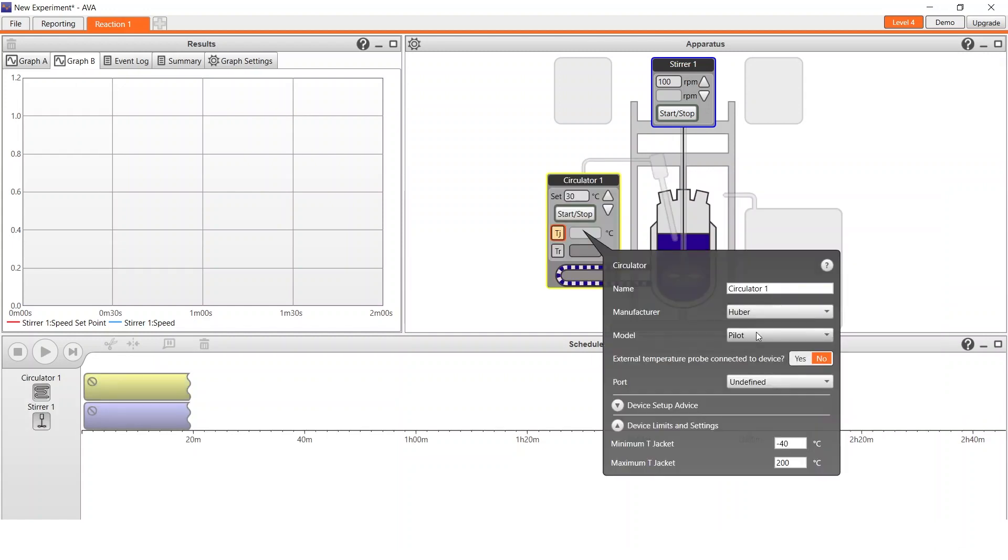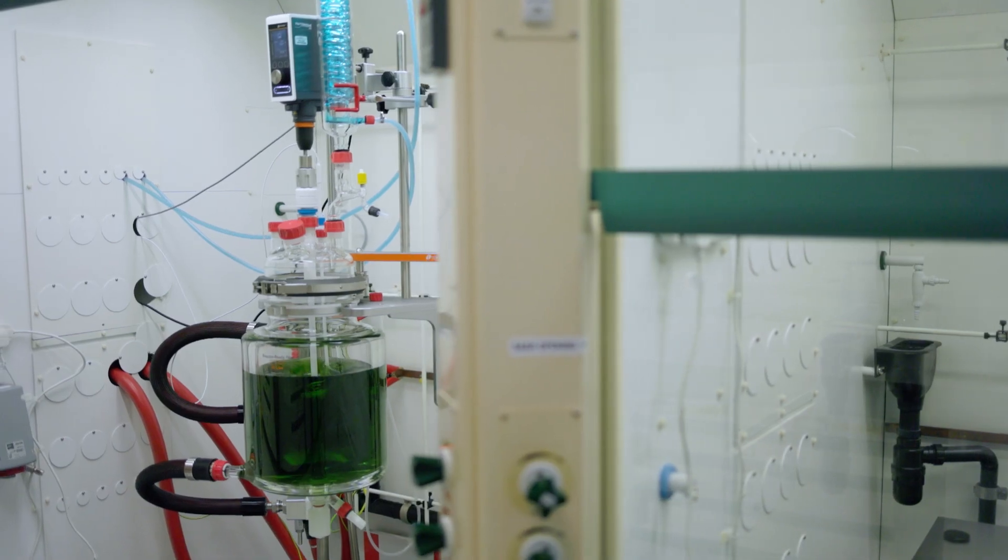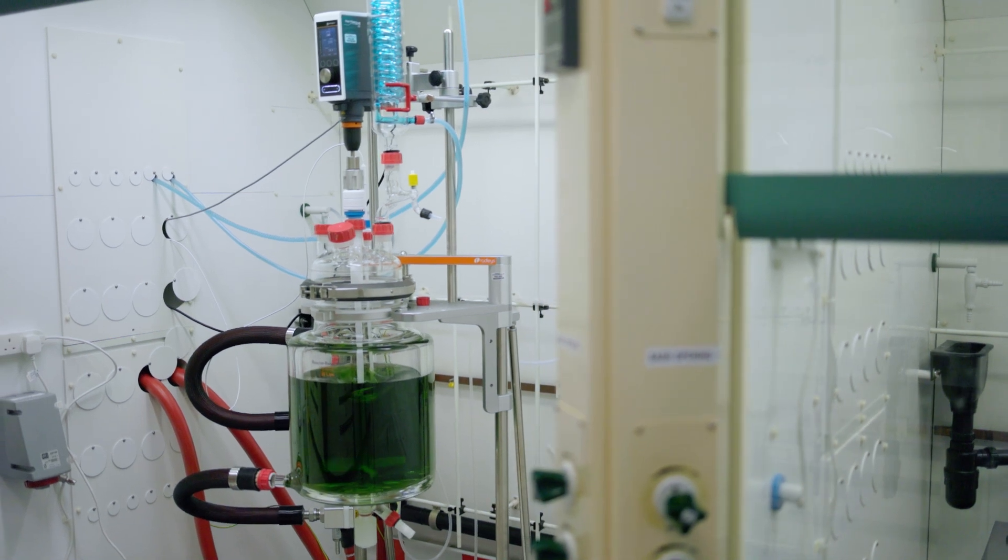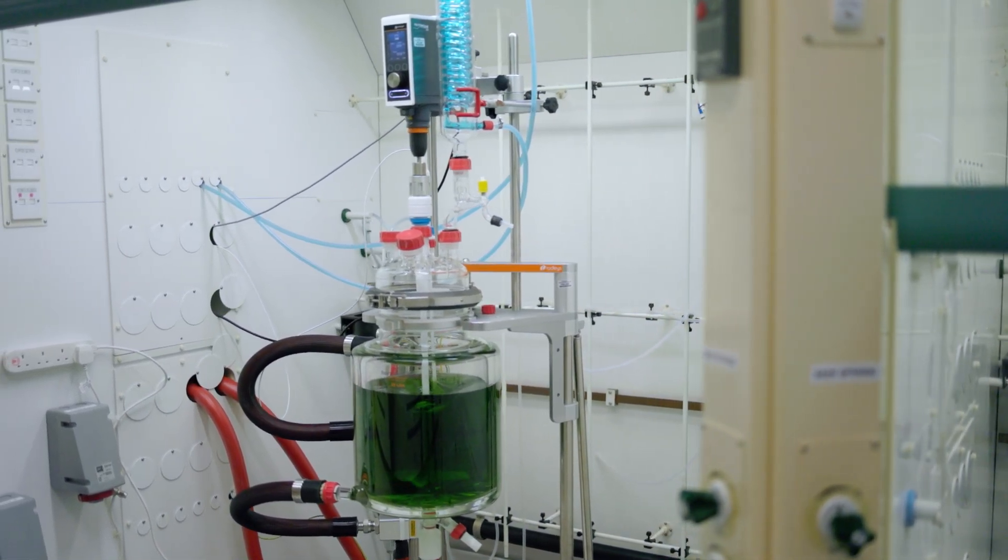It also controls the Hubers and the stirrers. With Ava we don't have to go into the fume cupboard so much, so I find it's a much safer way of doing chemistry. Beforehand we would have to be tinkering inside the fume cupboard, but instead everything can be done on the software and it just makes things a lot safer.